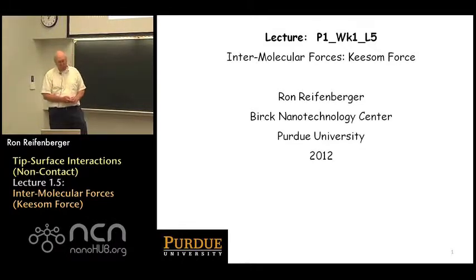So today we're going to focus on even more subtle interaction forces than we've already discussed. And in particular, we're going to focus on the Keesom force and the Debye force. We're going to derive those expressions for you and try to lead up to them in a systematic fashion.